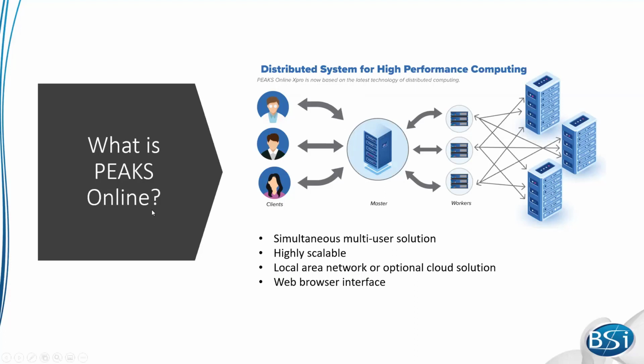I would like to point out, based on the name Peaks Online, you might think that it's an internet-based solution, but you do have the ability to set up a Peaks Online server on your local area network that will be closed off to the outside world, or you could set it up in an optional cloud-based framework.